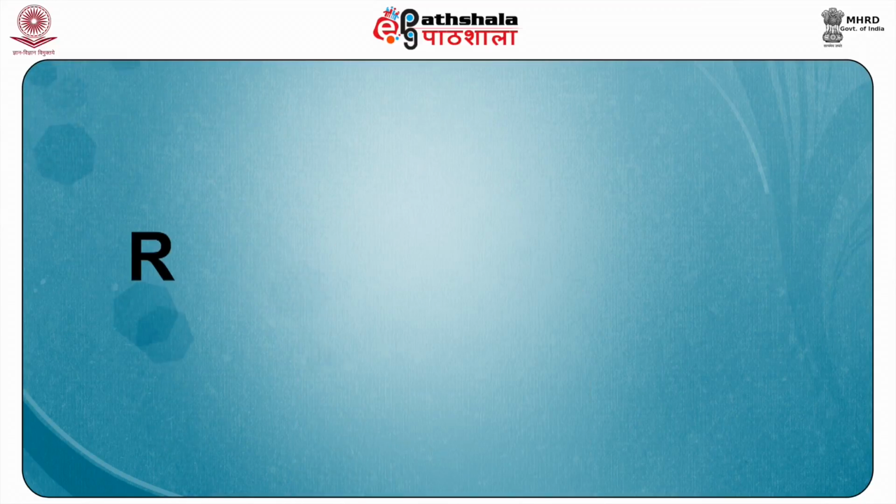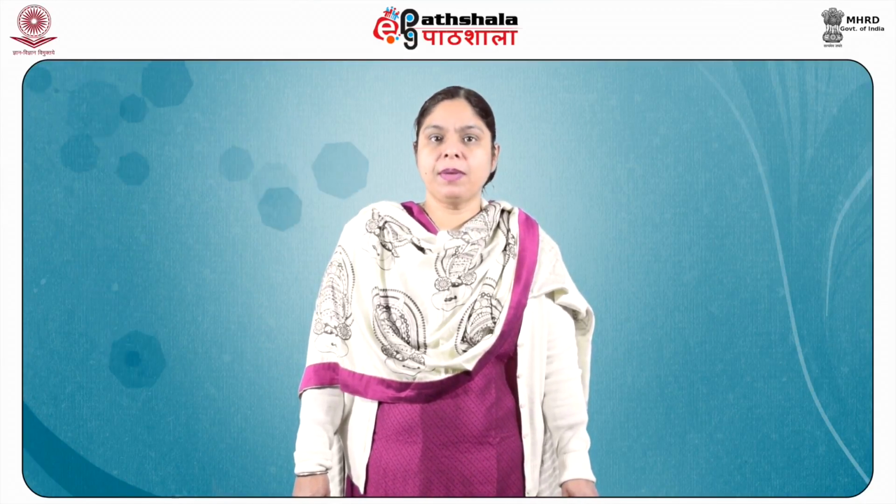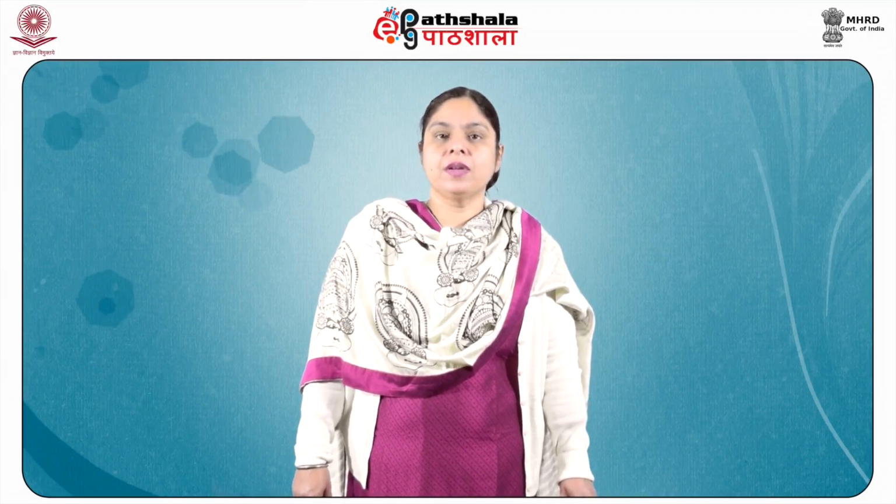Coming to a brief sketch of Raman and infrared spectroscopy. Now before going into the details of this spectroscopy method, let us first briefly discuss what we mean by the Raman effect. Now the Raman effect is nothing but the inelastic scattering of a photon, which was discovered by C.V. Raman long way back. By inelastic scattering we mean that the kinetic energy of an incident particle is not conserved. Some of the energy is either lost or increased.